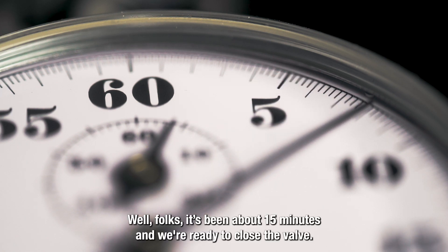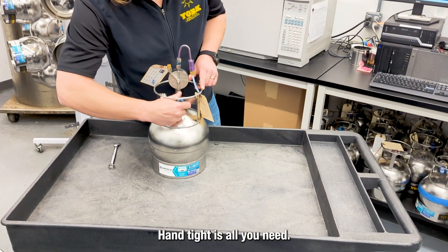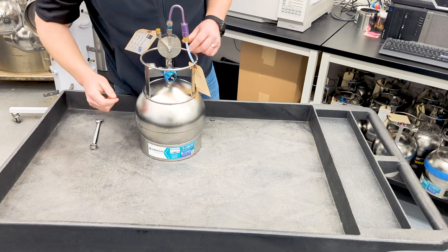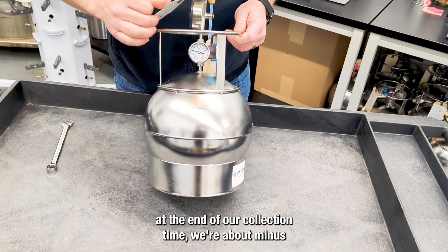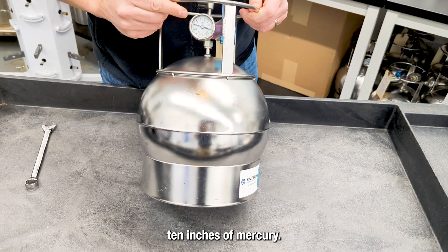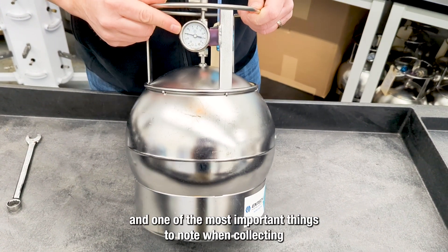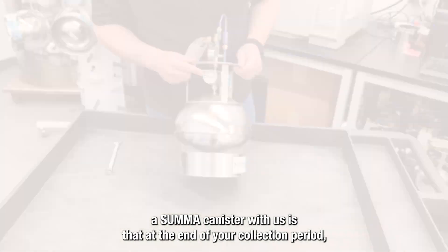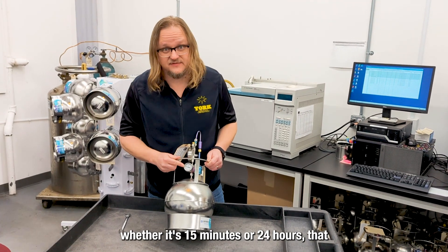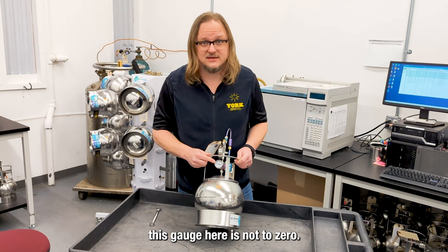Well folks, it's been out for 15 minutes and we're ready to close the valve. Hand tight is all you need. As you can see here, at the end of our collection time, we're about minus 10 inches of mercury.